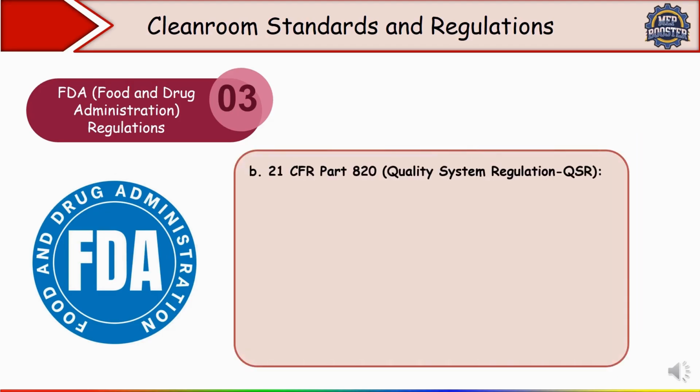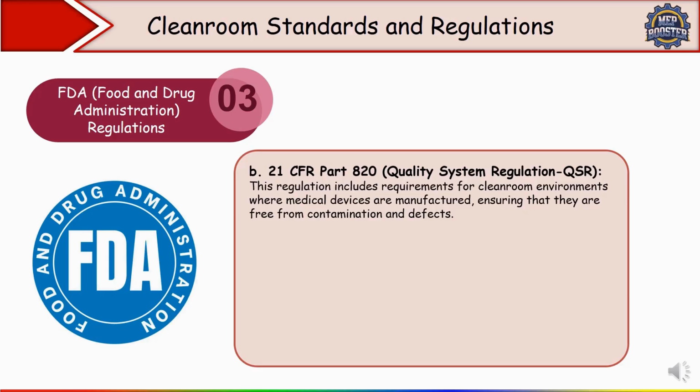In that, first we'll discuss 21 CFR Part 820, meaning Quality System Regulation. This regulation generally includes requirements for clean room environments where medical devices are manufactured, ensuring that they are free from contamination and defects. Is it clear?